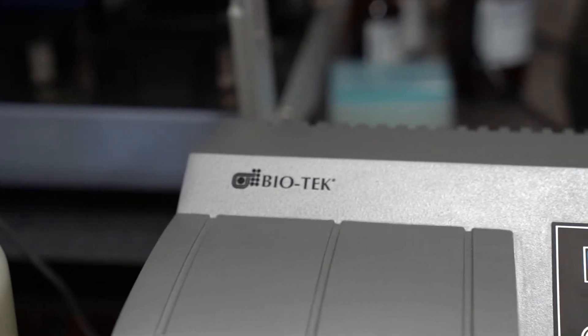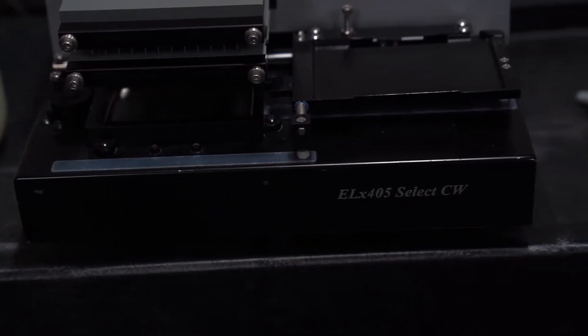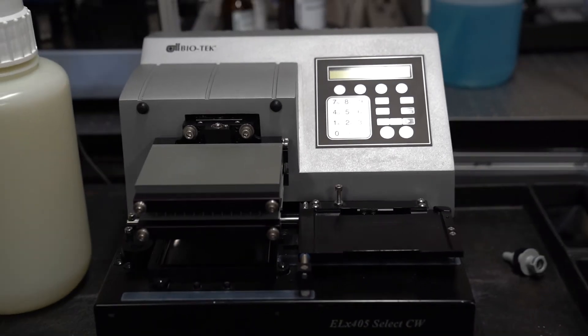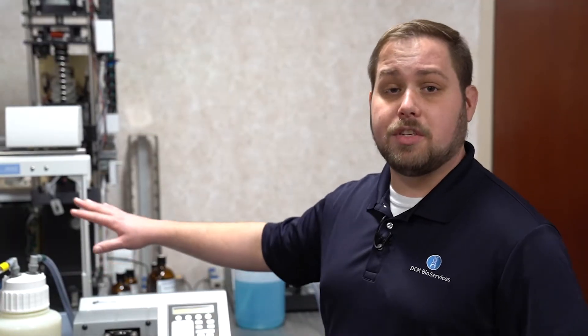The 1400 error code indicates a vacuum failure somewhere within the ELX405. Oftentimes it could be a faulty fuse on the pump, the pump may not be switched on, or there could be a tubing disconnection somewhere in the waste line.